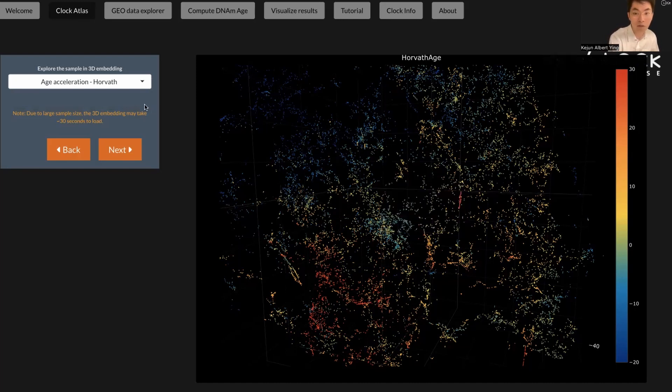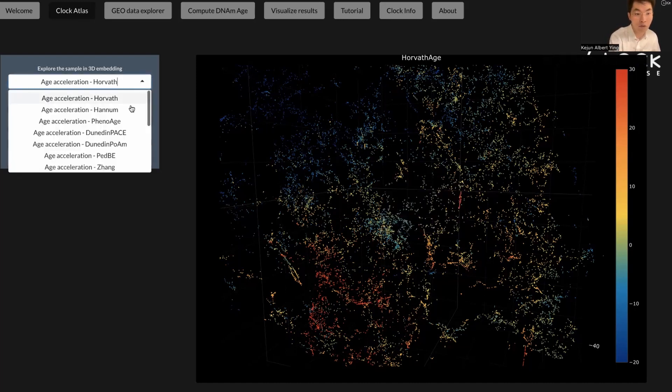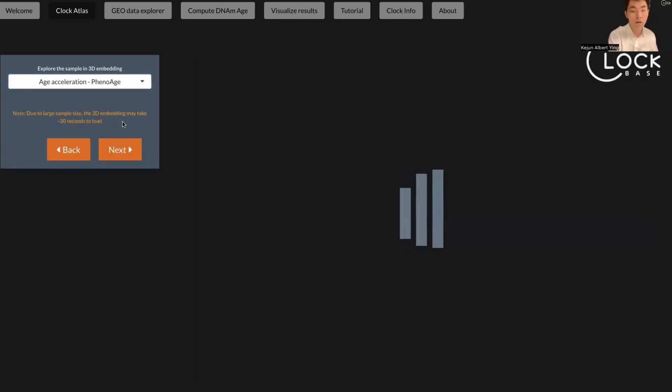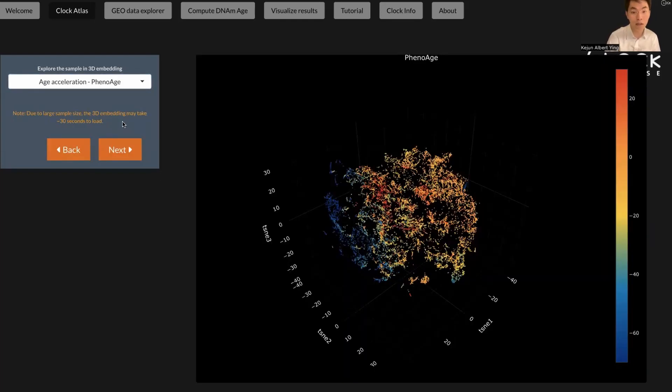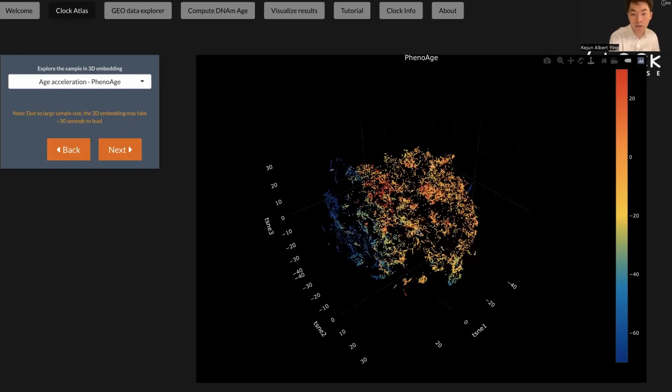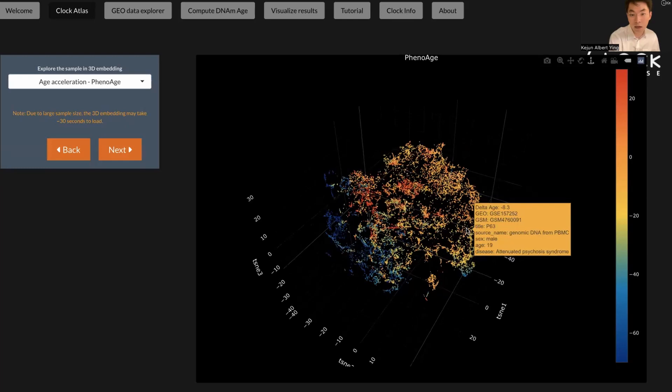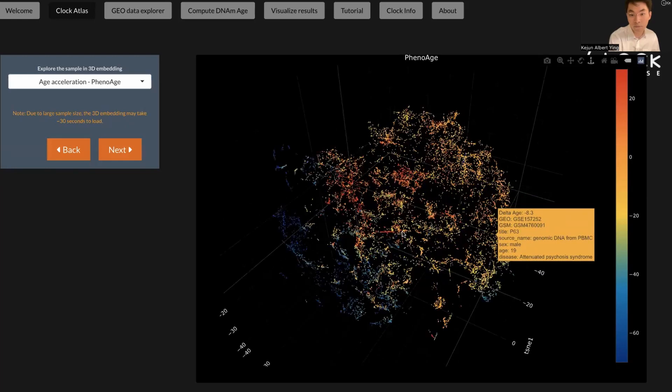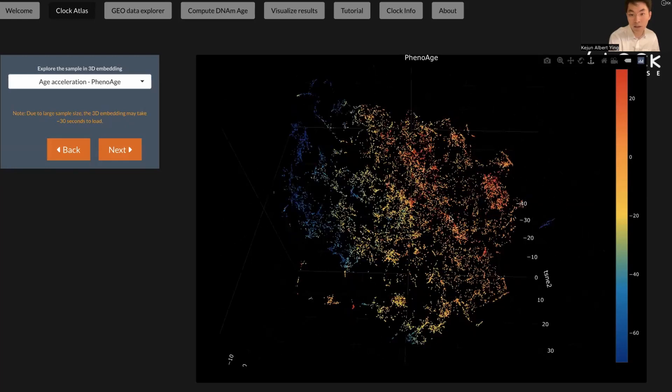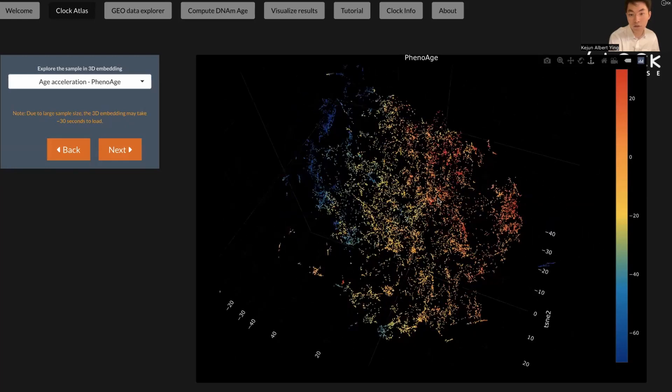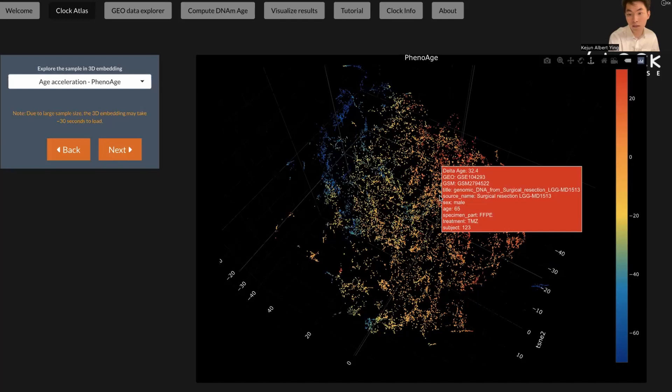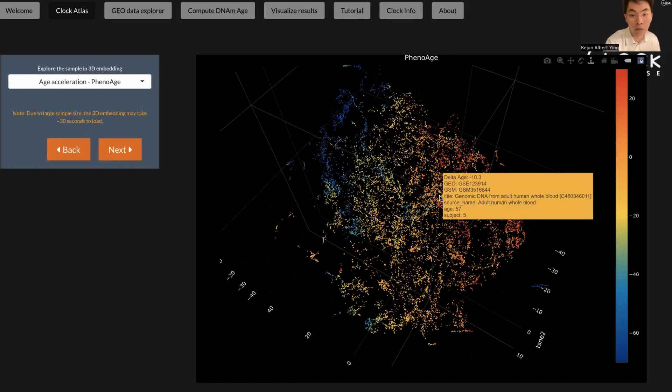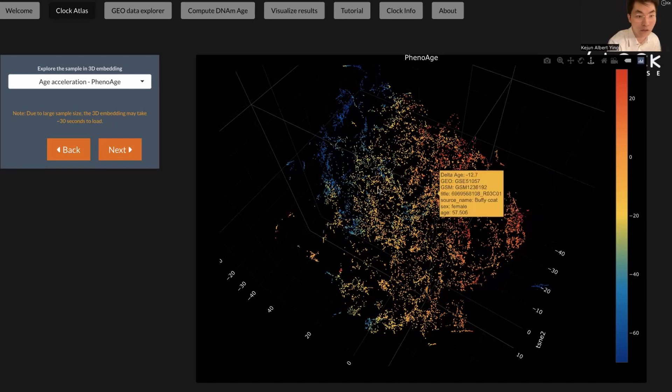You can also change it to other clocks. For example, if you're interested in the phenol age, which is a second generation clock that's trained on phenotypic data. Here you can see this is a similar t-SNE plot, and you can visualize the delta age based on the phenol age prediction.